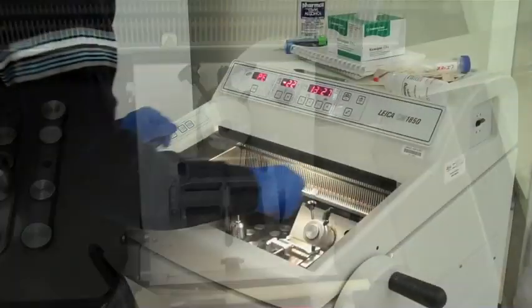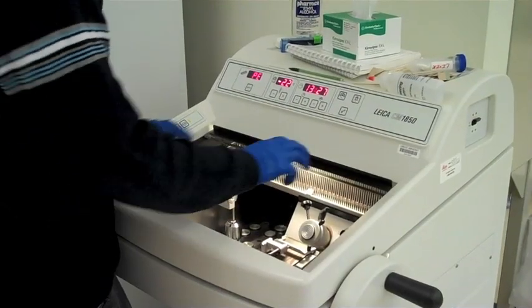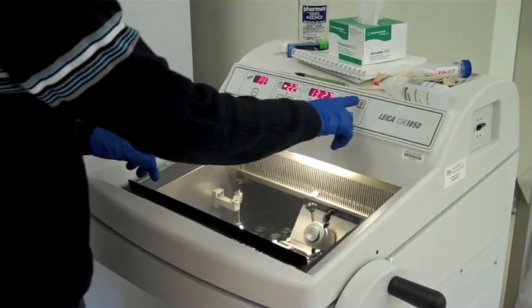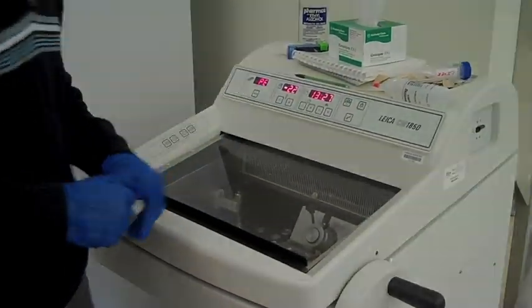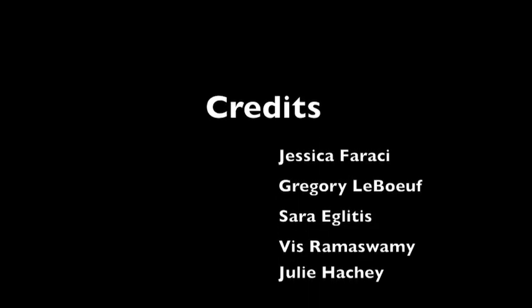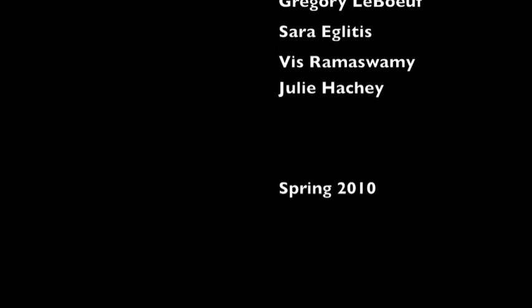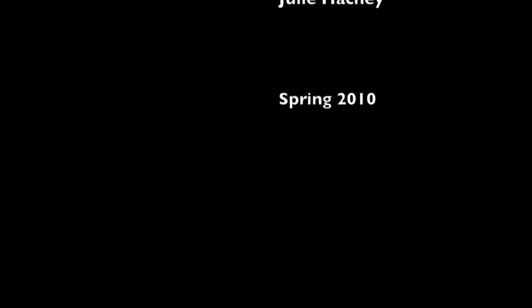When you are done, don't forget to close the lid and turn off the light.